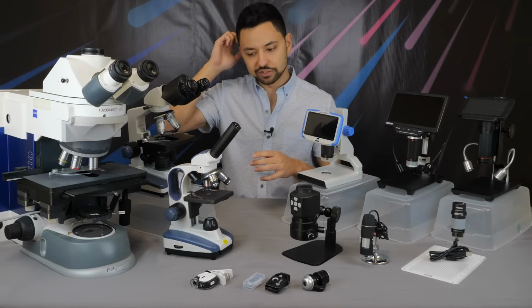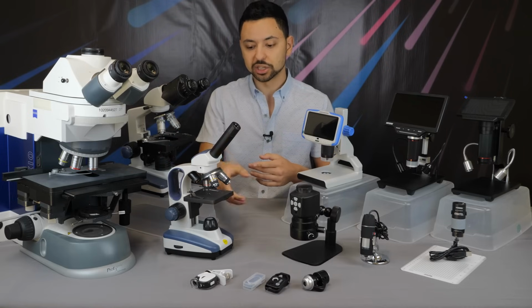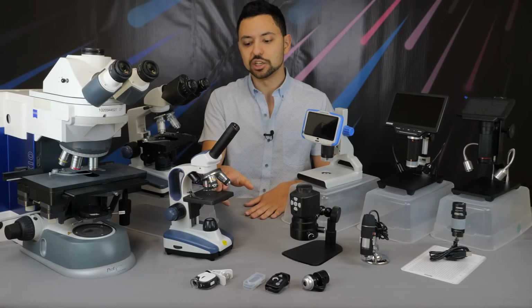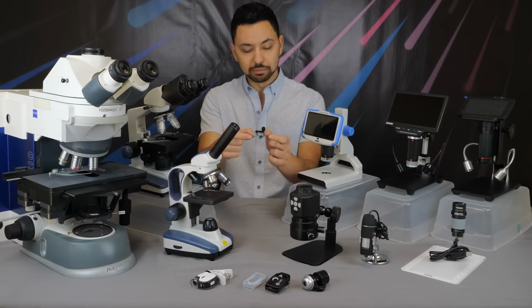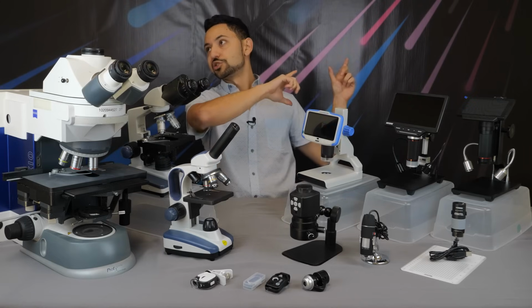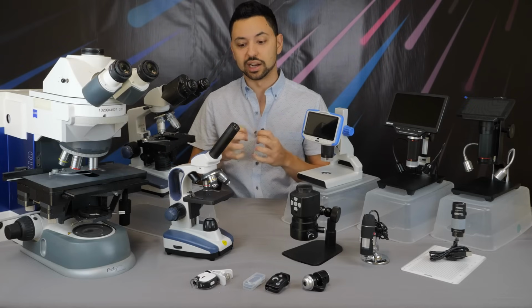So the way that they've cheaped out here is that they are not including a condenser lens like you would find in a little bit better of a microscope. They instead have this rotating wheel that has different apertures on it to adjust the amount of light throughput on your sample. And they have no mechanical stage as well. So this is an issue when you are looking at objects under very high magnification. If you're having to manually move the microscope slide with your hands, even the smallest possible movement you could do with your hands is going to look like it's just raging across the screen under a microscope. And that's why mechanical stages are so important at high magnifications.